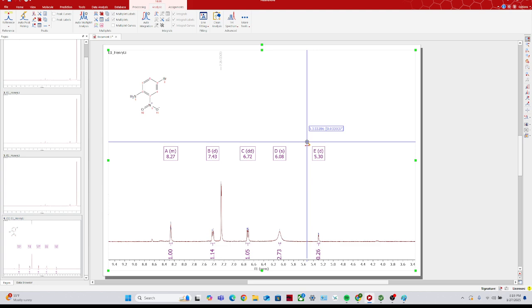So if you have more peaks than you expect, the first thing you should typically do is assume they're solvent and try to figure out what you can attribute that to. However, if you can't do that, they're probably actually impurities, and characterization of that can be a completely different thing than what I've just described to you. I've only described how to do the actual product, and the impurities necessitate more care. It's a relatively difficult process. You have to isolate the impurity.